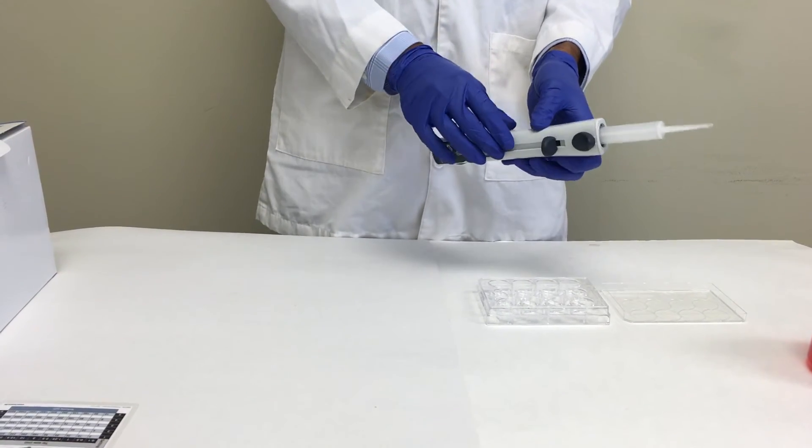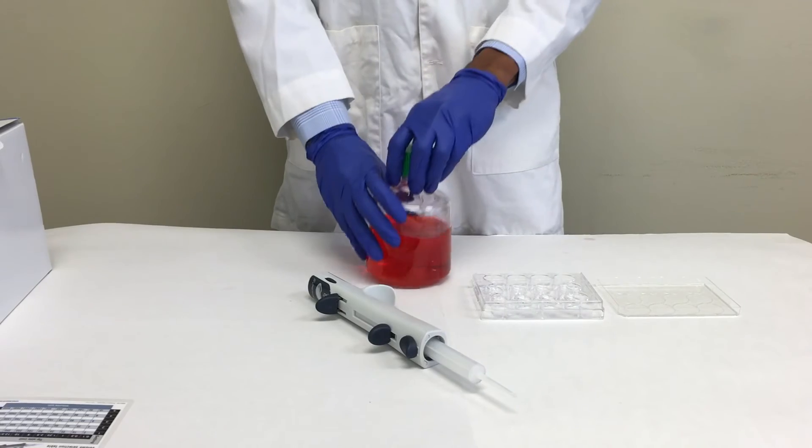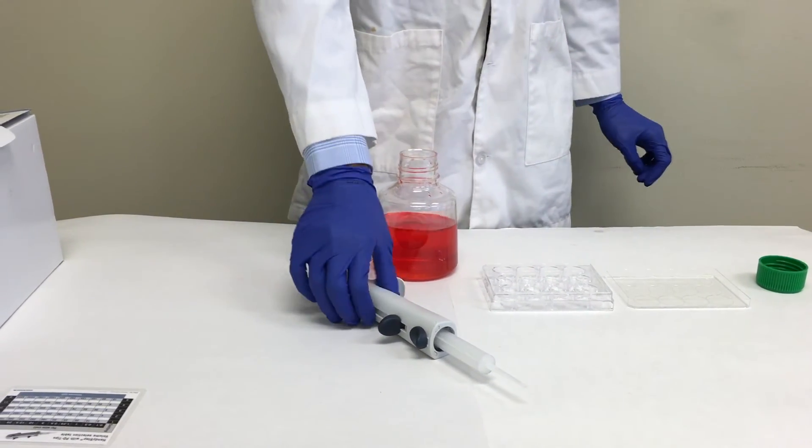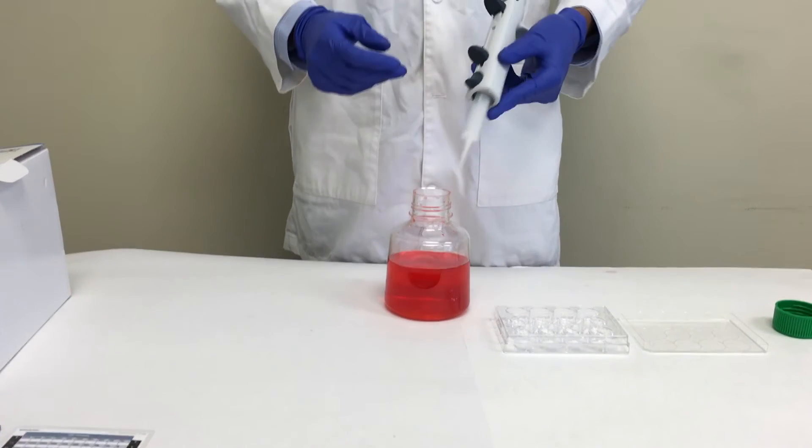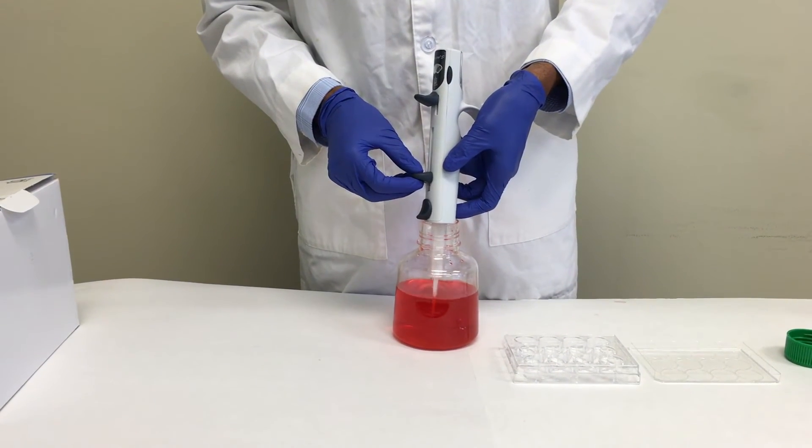When you are ready to start filling up the syringe, bring your bottle close to you. Make sure you insert the tip into the liquid, enough for it to fill up. Then, slowly raise the filling lever until your syringe fills up to the top.